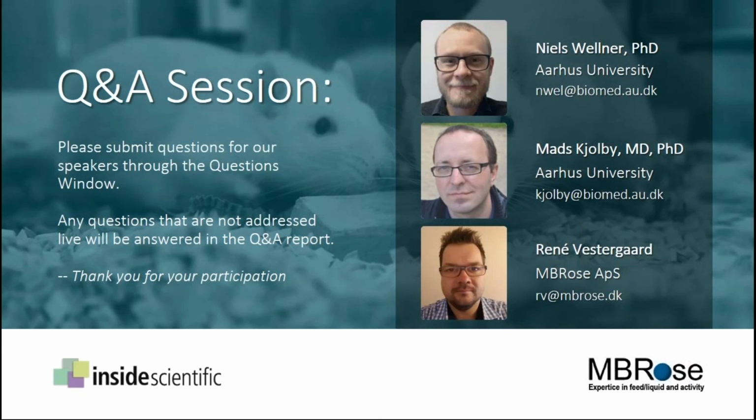Perhaps Renee can back me up here. Yeah, in the food hopper we have bars that are fairly close, so they can't get large pellets out of the hopper, and there's also a grid under the channel, so any spillage will drop into the tray under. So it's not a common problem we see. Okay. Very good.